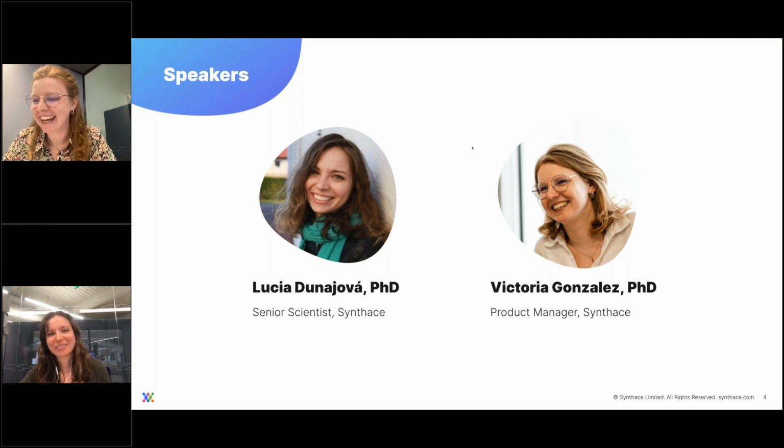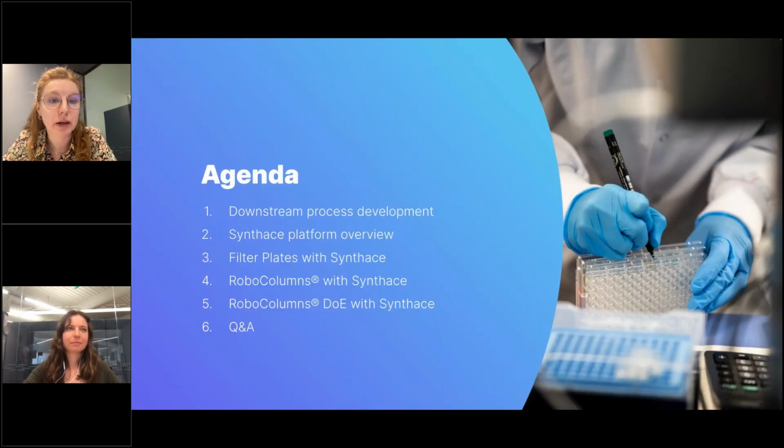Thanks, Lucy. So I will just also give you a little bit of an overview of what you're going to be hearing about from us today. So first, I will start by talking a bit more generally about downstream process development and the challenges that we encounter there and how Synthace can help address those, and also particularly focus on high throughput process development tooling. I will also give you a brief overview of the Synthace platform, and I'll hand over to my colleague Lucy, who will walk you through how to set up actual applications with Synthace.